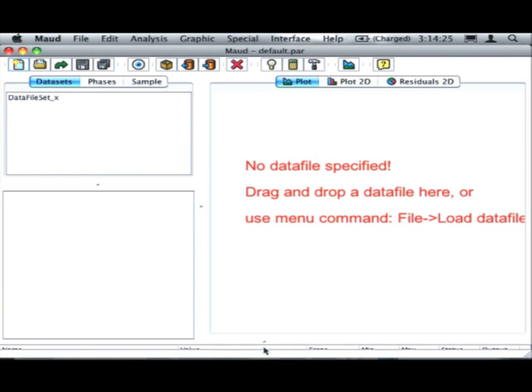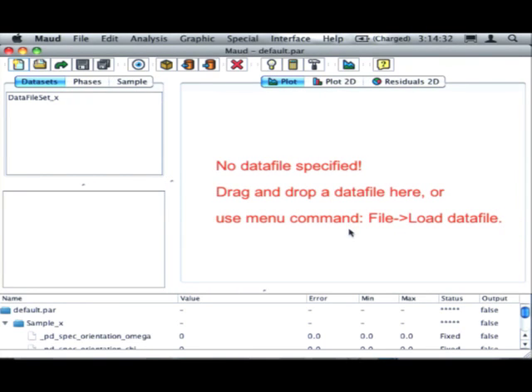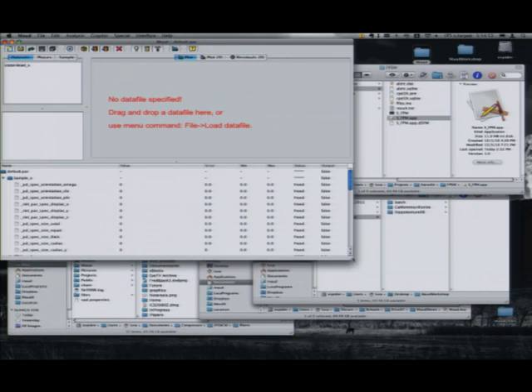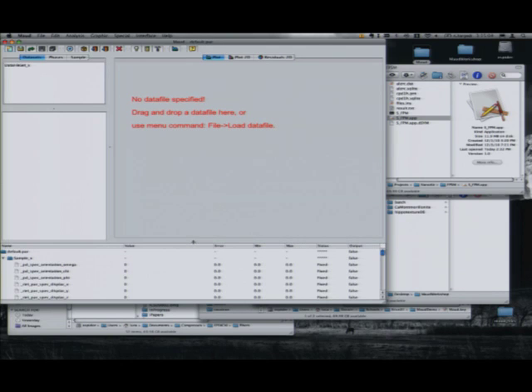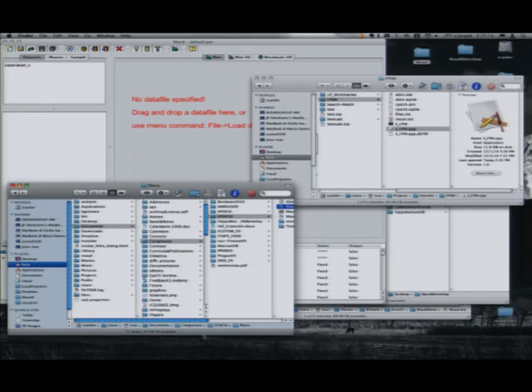So, okay, that is what you get if your screen is small, like here. MAUD is better if you have a bigger screen. Actually, here we can select a little bit more. So let's say with this one. Yeah, it works. Oh, much better. I didn't see that. So the video is quite well. Okay, there are some examples in MAUD that are saved exactly in the directory we created.